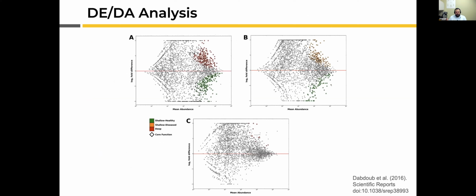And so again, this is just a real-world example of differential abundance analysis. This is from another shotgun sequencing study that we did of gum disease. You'll see we have three groups. We have the healthy subjects, or the healthy teeth. We have healthy teeth in people with chronic periodontal disease. And then we have teeth in people with chronic periodontal disease, but with active disease.